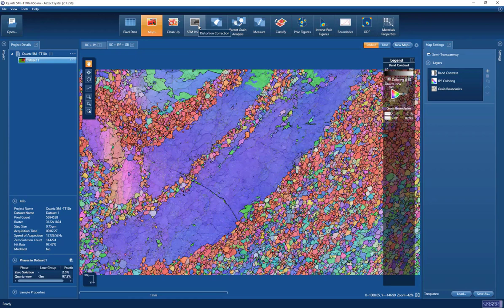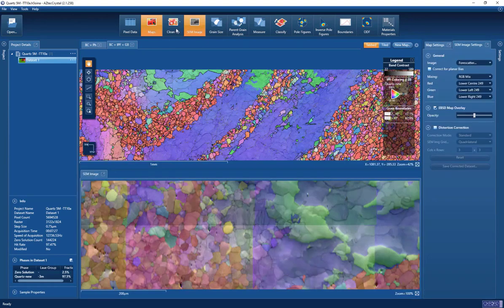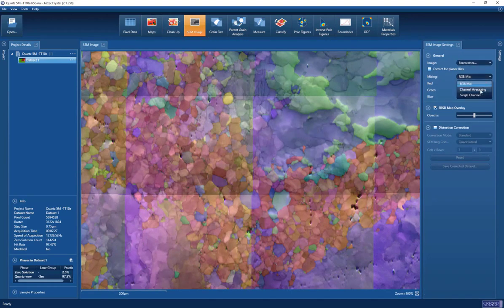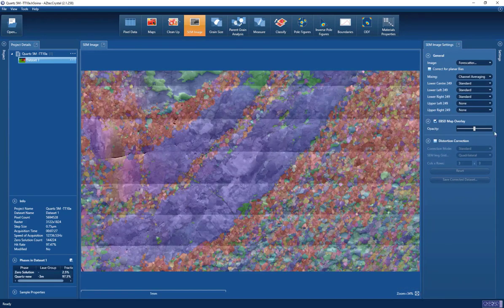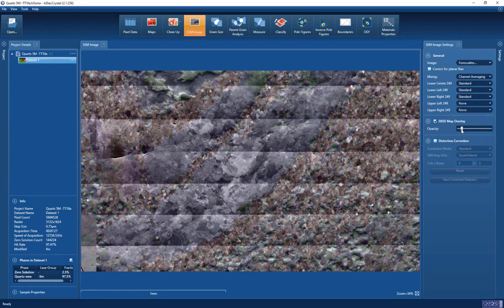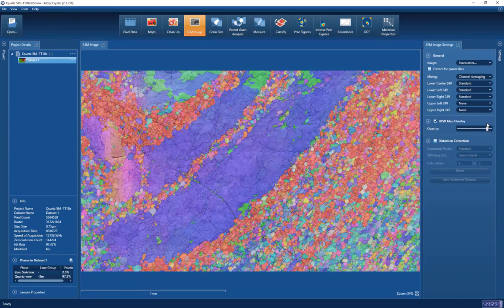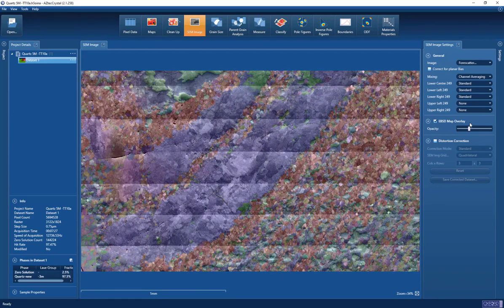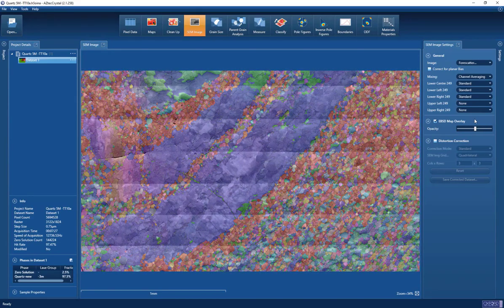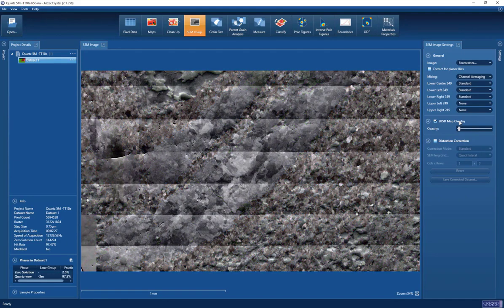The first thing we typically want to do is check how much cleaning of the data we need to undertake, and part of that is to assess whether the data have been distorted due to significant drift during the analysis. In our new version of Aztec Crystal we have a distortion correction tool. Here we look at the electron image — a montage of individual forward scatter images — and by changing the transparency we can see that the positions of features in our EBSD map match very nicely with the positions in the forward scatter image, so no distortion correction is needed for this data set.